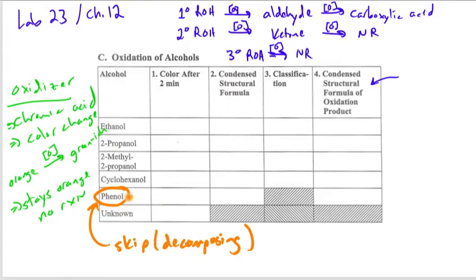Long story short, the phenol group, those aromatic compounds, just act differently. The hydroxy group on the aromatic ring actually causes that ring structure to be really reactive under certain conditions. And I think that's what's happening here. And actually, I am going to just mark that out.